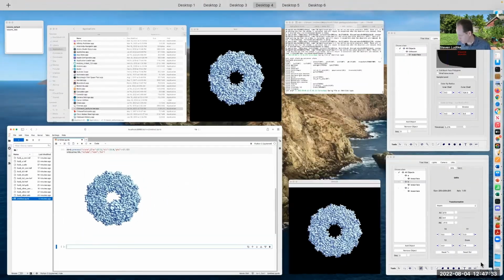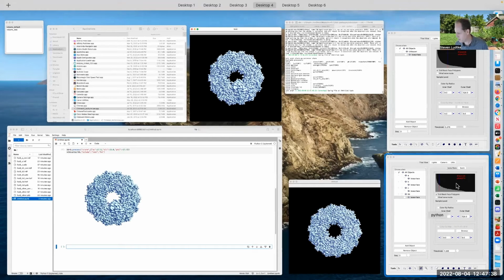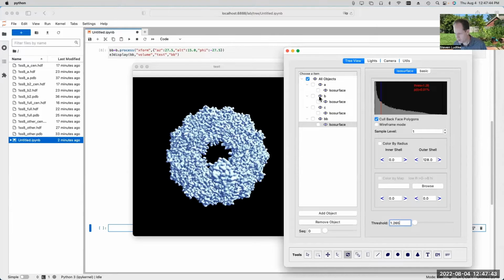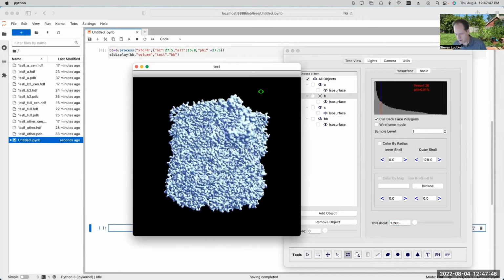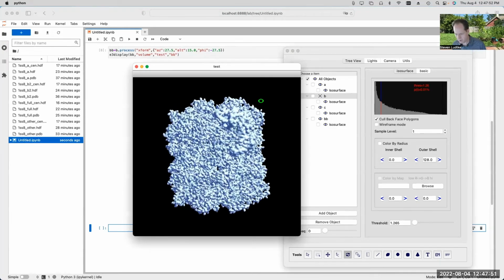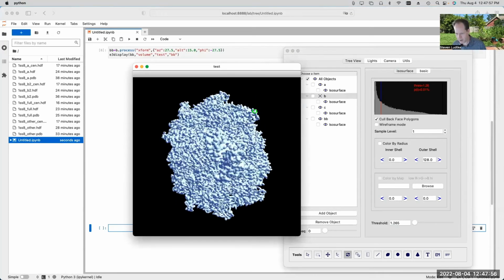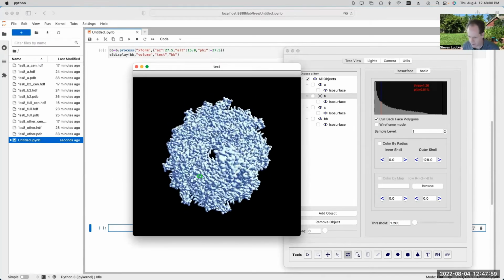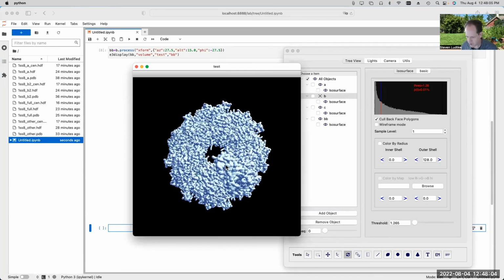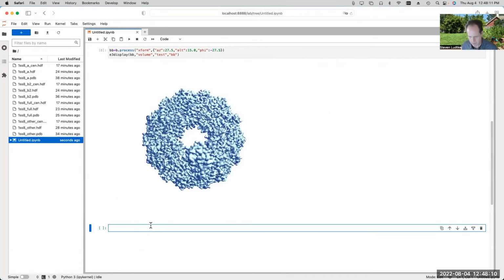Okay, and you can see it's rotated. Again, the isosurface threshold has changed, but that's fine. Bring this to the front too. And if we turn off B, now we can see how it's rotated. So not a biologically realistic rotation or anything like that, but at least it's something. So we can now rotate that subunit by some amount that we like. If we want a nice extreme motion, we could make it up to maybe 15 or 20 degrees, probably no more than 15.